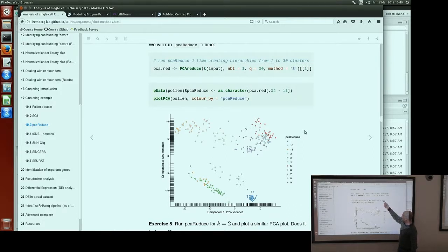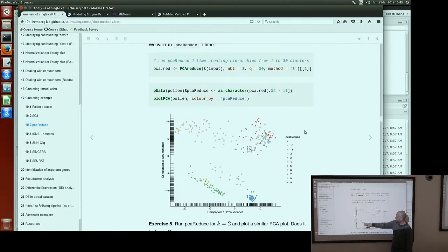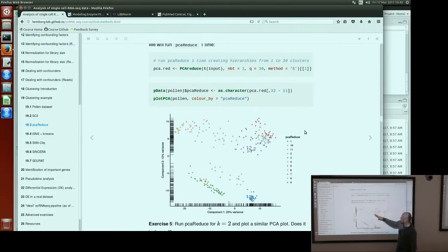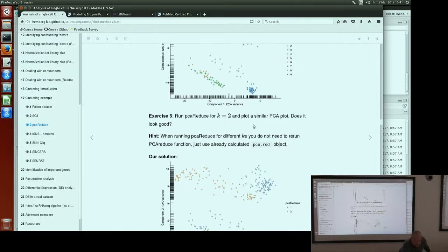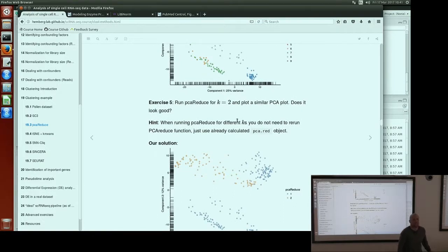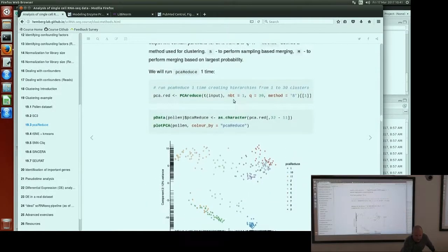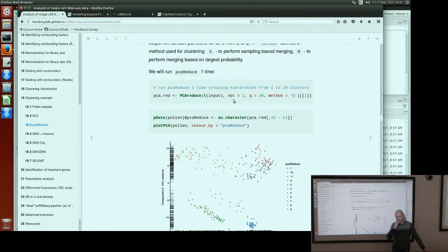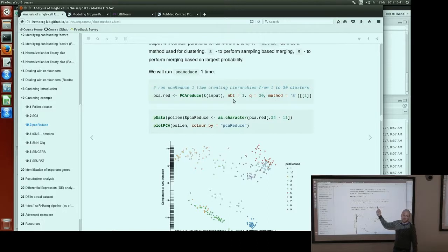Looking at k equals 11 for PCA-reduce: there are some differences — from here, two clusters are identified by PCA-reduce. But otherwise these clusters look fine. PCA-reduce is also a stochastic method but consensus is not implemented in the method. There is an exercise: if you run it for k equals 2, it should split one group from another, but instead it takes part of a large cluster as well. So the k equals 2 solution may not be the best.